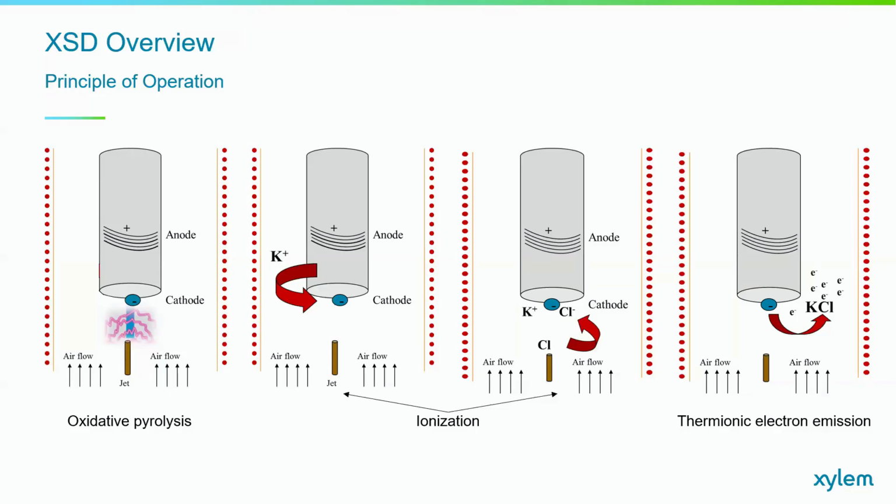And finally, thermionic electron emission. This is the process in which electrons are emitted due to an increase in temperature. So thermionic, increasing temperature, electron emission, causing electrons to emit. The material, often metal, is heated to a high temperature, causing electrons within it to gain enough kinetic energy to break free and enter the surrounding space.